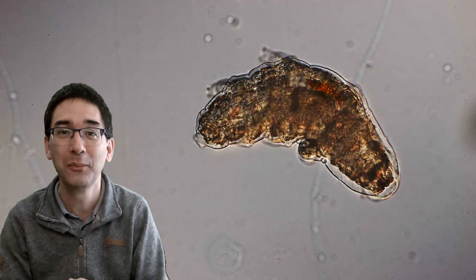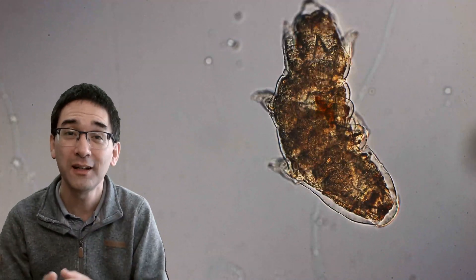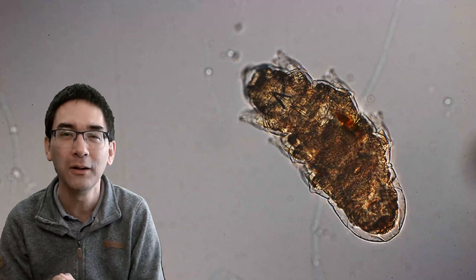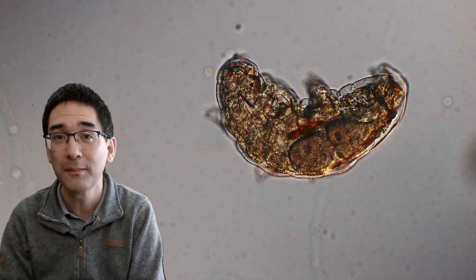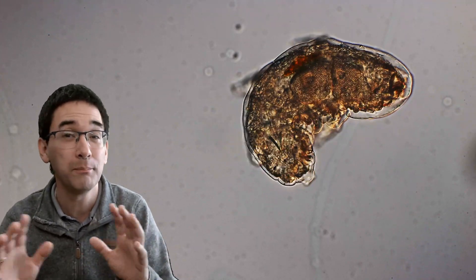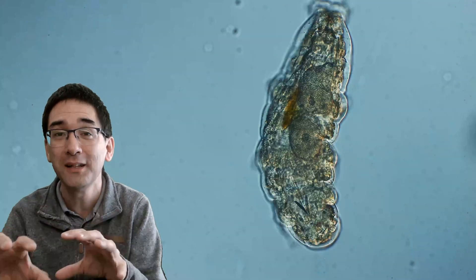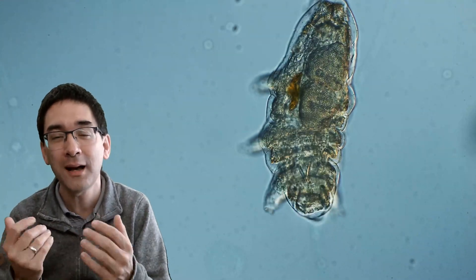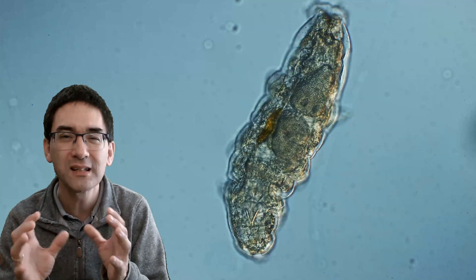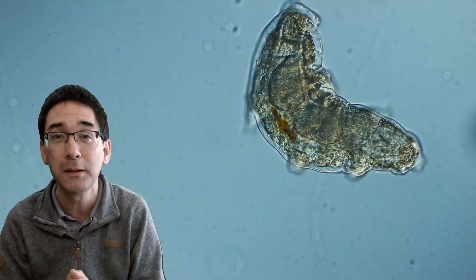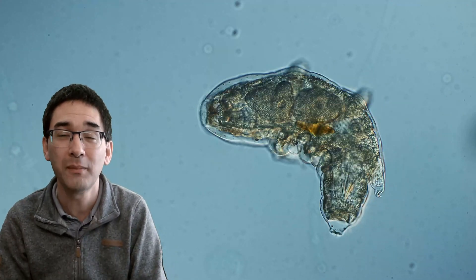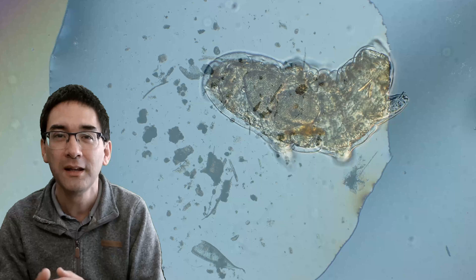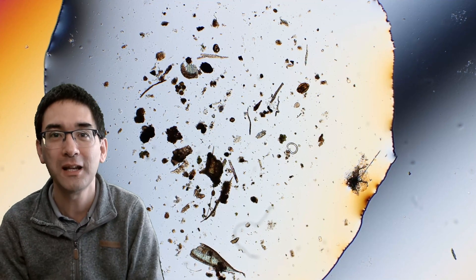Other people also ask me, well, why don't you put the magnification in the corner? And I can tell you, well, those tardigrades, they don't need a lot of magnification. They're not that small. And if you magnify them with your 10x or 40x objective, then you're going to see them perfectly. But what I'd like to do is I like to zoom in a little bit also into the video. So the magnification in the corner really doesn't make a lot of sense all the time. It might actually confuse people more than it actually helps them. But I just want to tell you, with a 10x microscope objective or 40x, you're going to see them perfectly and pretty much all microscopes are able to magnify.